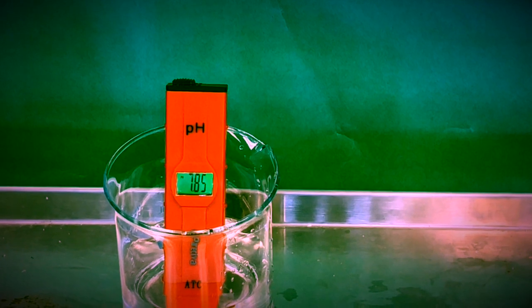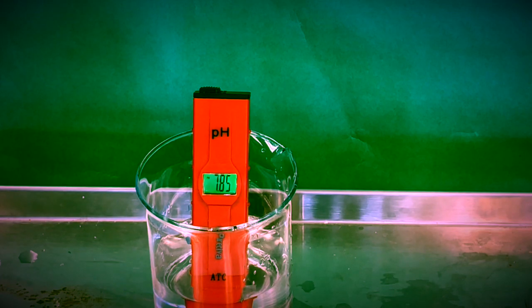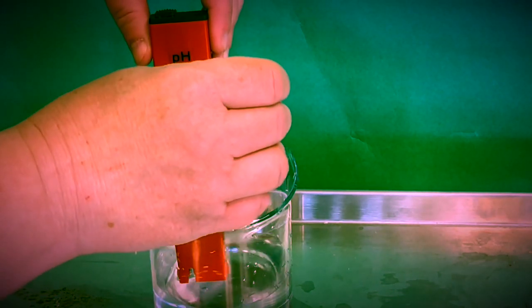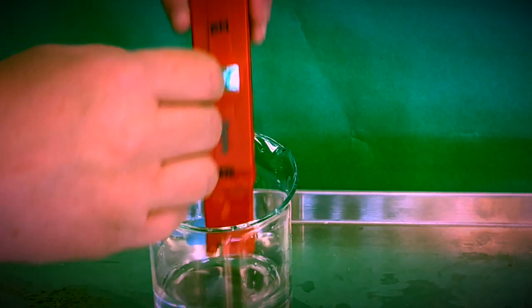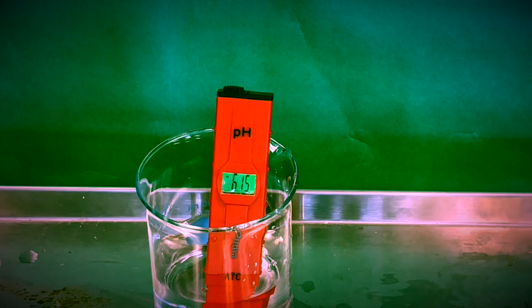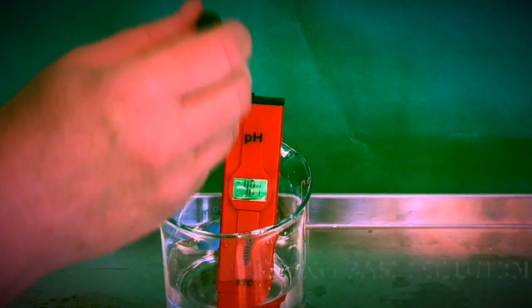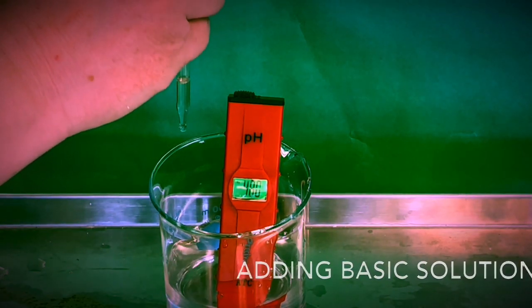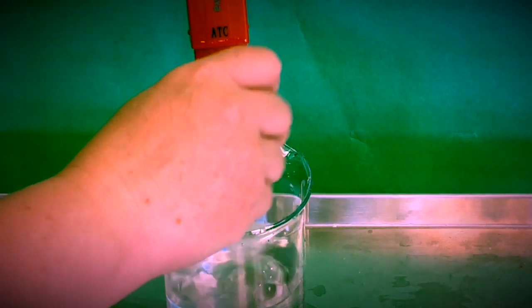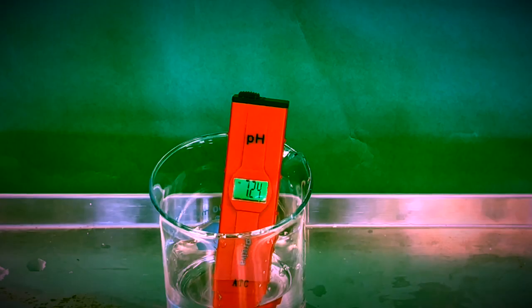Here, we have a beaker with a digital pH meter to show us the measured pH throughout the experiment. Our water is starting off near neutral, which is what fish and other aquatic species like. But what happens when just a little bit of acid is added to this water? So to combat this decrease in pH, we can add some base, but sometimes we overshoot it and then we drive the water into alkaline conditions, which is also not ideal. We can eventually get back to neutral, but this will take time.